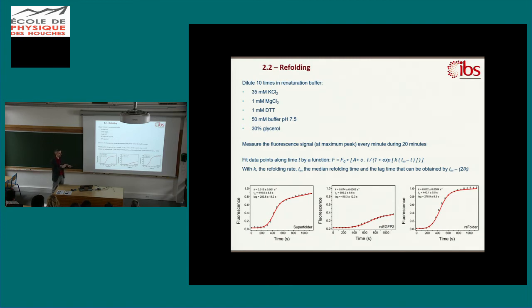the signal recognition particle pathway, Philip Tinfeld showed that if you secrete this GFP into the periplasm and then you extract that and put it on a gel, then you'll have a ladder of proteins. It will interact with every crap you have in the periplasm, and you'll have a real ladder. While for a superfolder, you have a neat band.